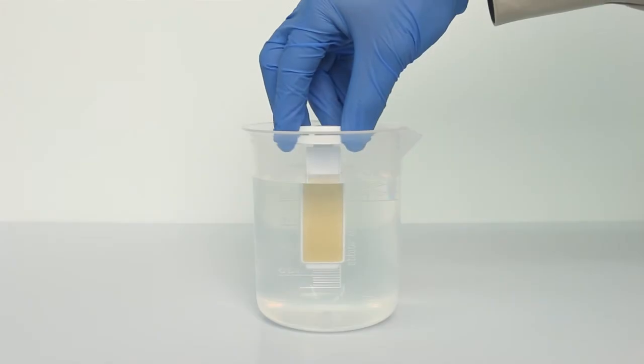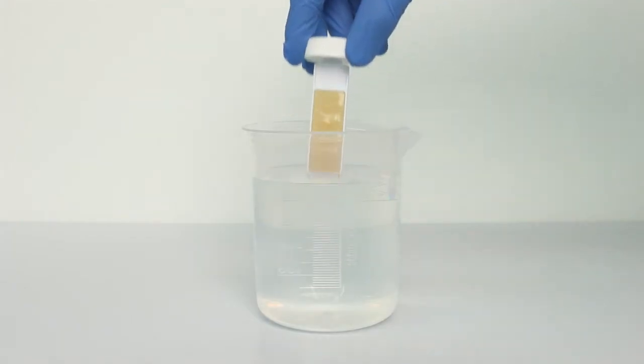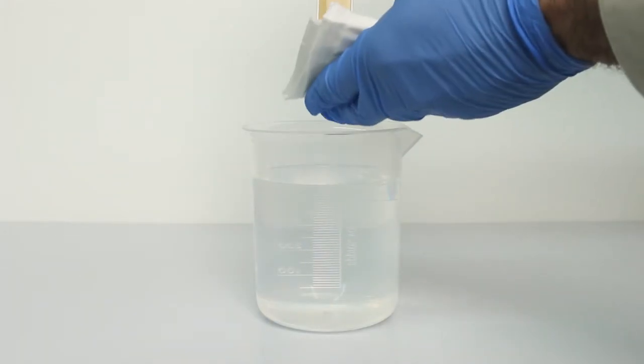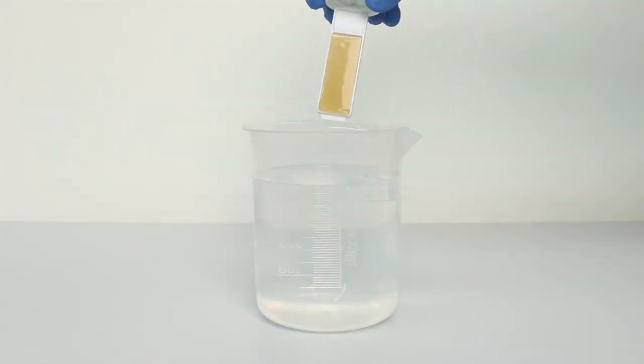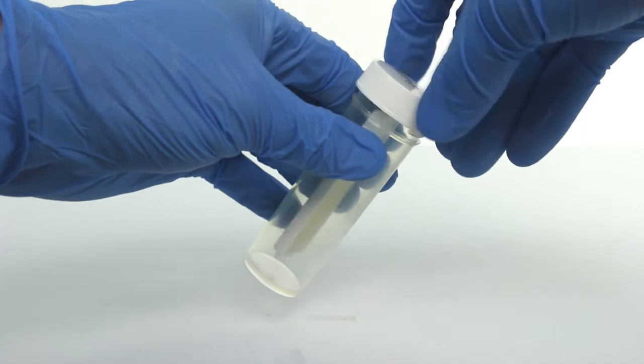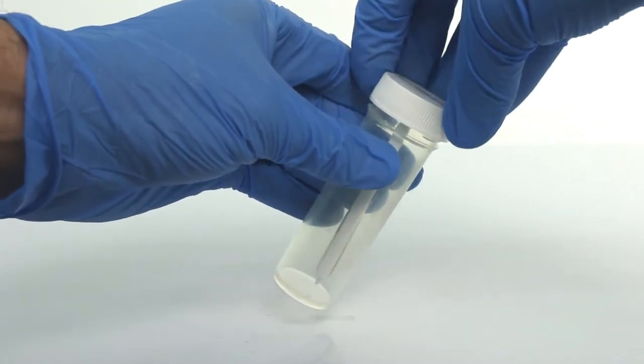Dip the slide into the water to be tested, covering the agar surface for a minimum of 3 seconds before removing. Allow excess fluid to drain from the slide. Remove the remaining drops by touching the end of the slide to sterile absorbent material. Screw the cap back on lightly and then back it off 1/2 turn.